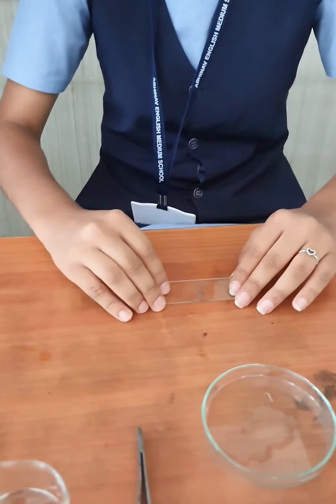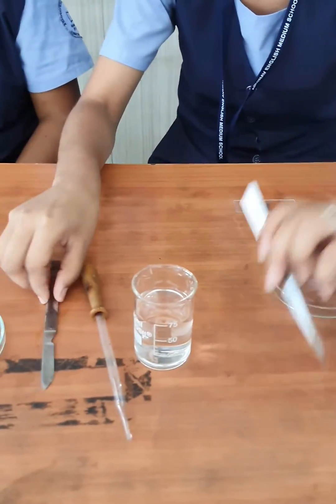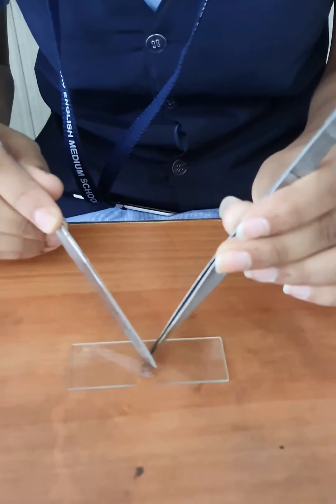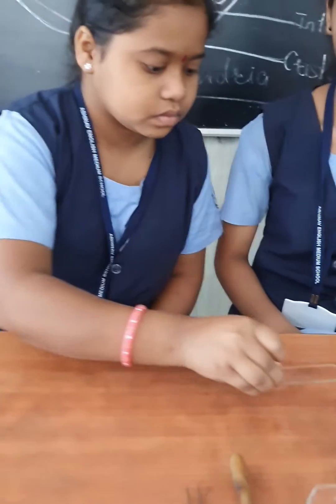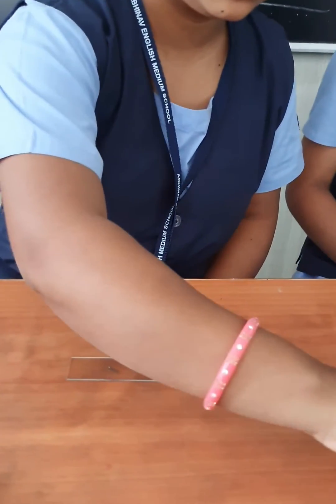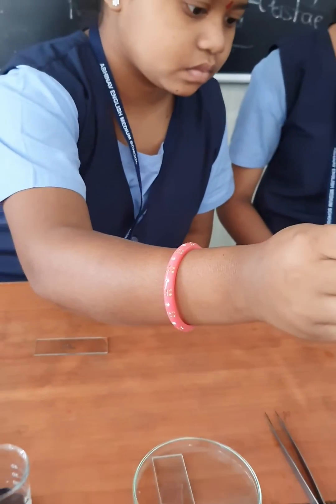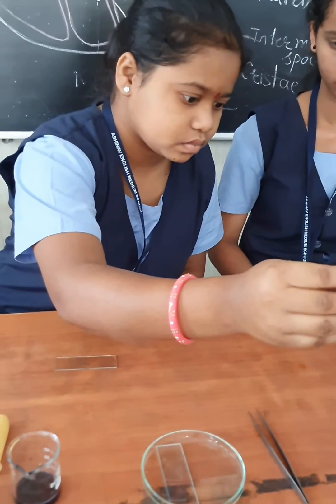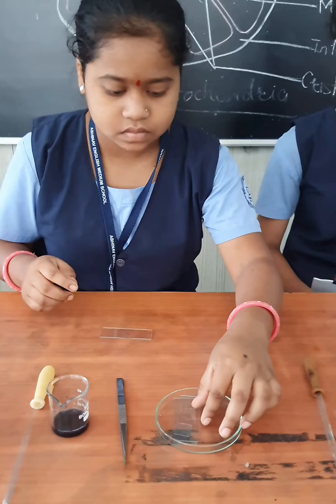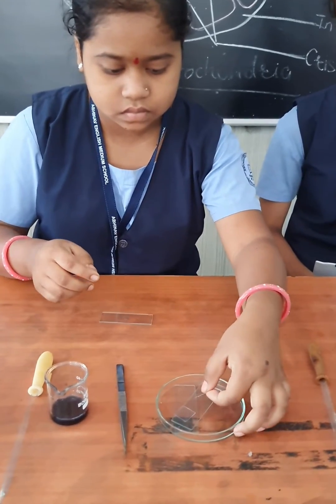Now we are going to prepare the slide to observe under the microscope. Cut a small section of the peel to observe under the microscope. Put 1 to 2 drops of water on this peel, and put the cover slip carefully.